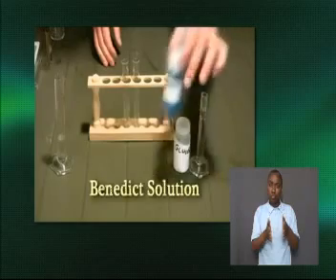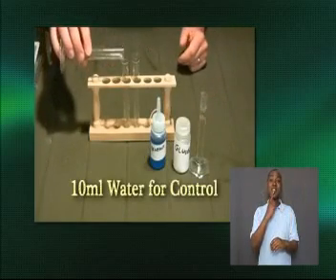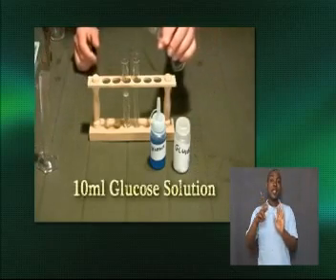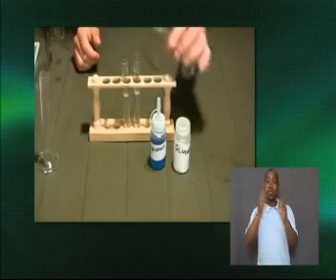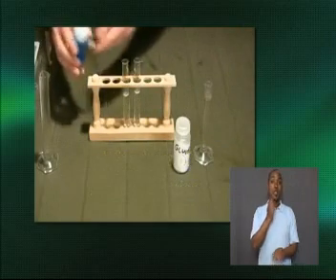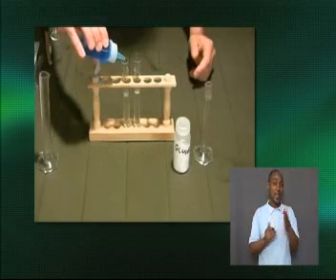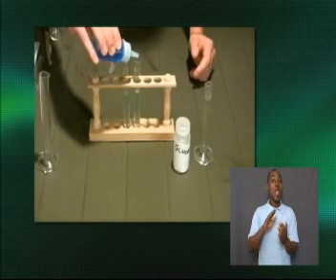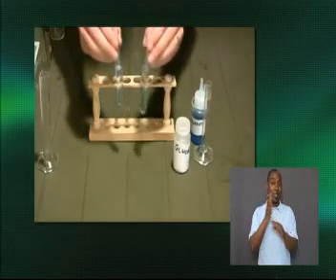Equal parts of the starch and amylase solution are combined with Benedict's reagent in another test tube. Both test tubes are heated in a water bath for 1 minute. The results of the color of the solution are immediately observed and recorded.